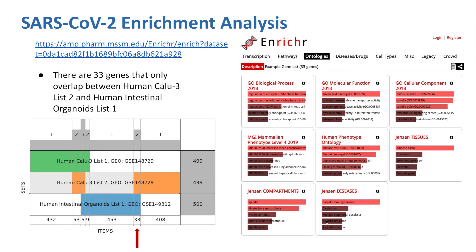Using the same super Venn diagram, we were able to see that 33 genes overlapped between the bottom two sets. So using the Aperture, I was able to obtain a list of those 33 genes and sent them to Enrichr for further analysis. Here we can see the results of the enrichment analysis. Many of these genes are involved in the cell cycle, such as the regulation of the G2M phase transition, mitotic cell cycle phase transition, and the spindle assembly checkpoint. This suggests that the downregulation of these genes can make it difficult for these cells to mount an immune response.